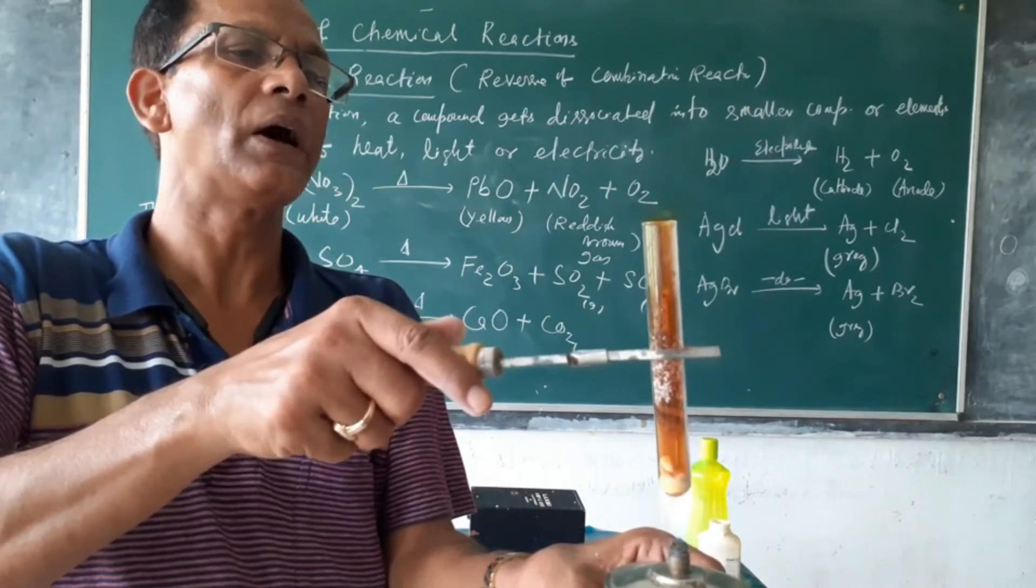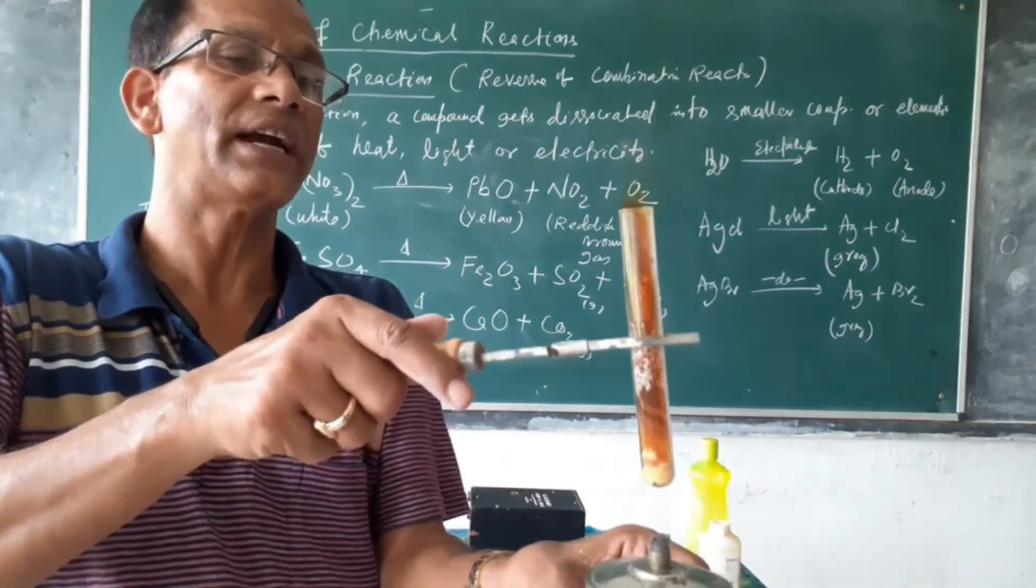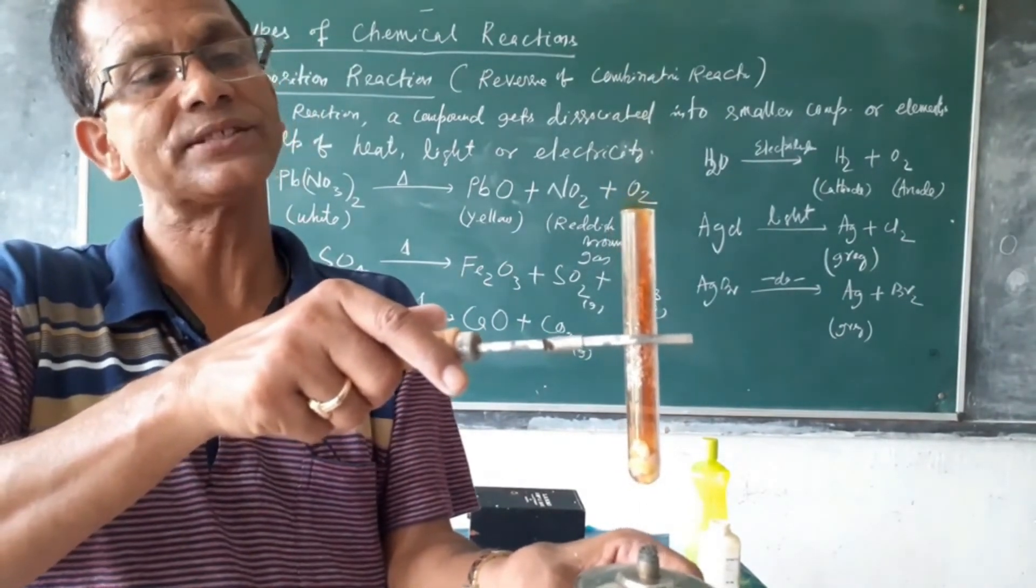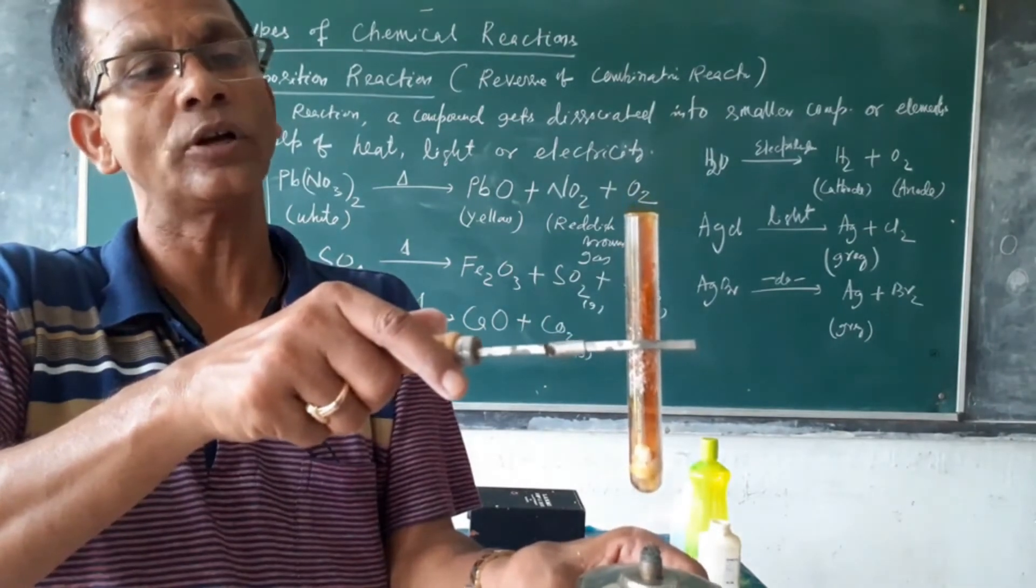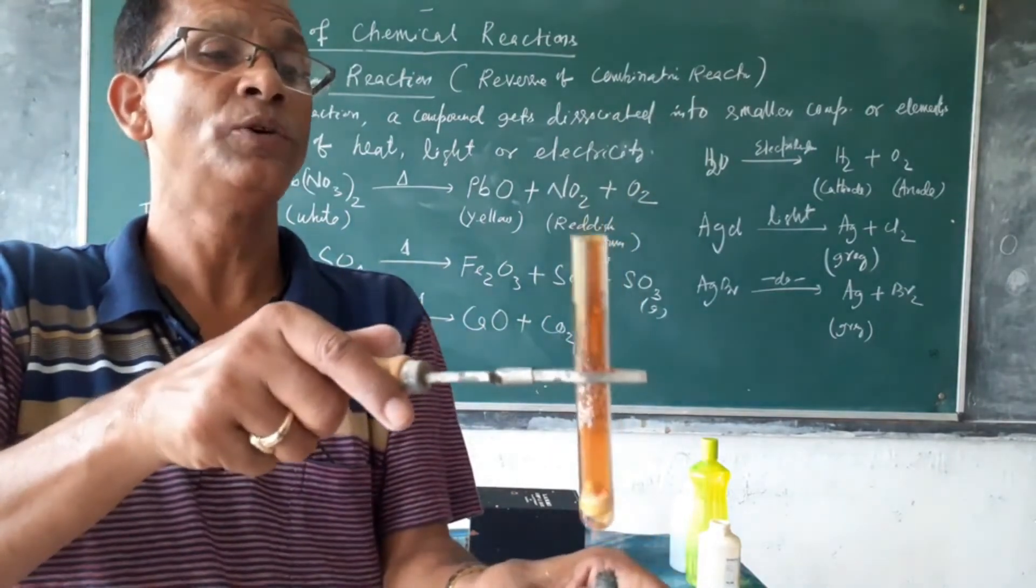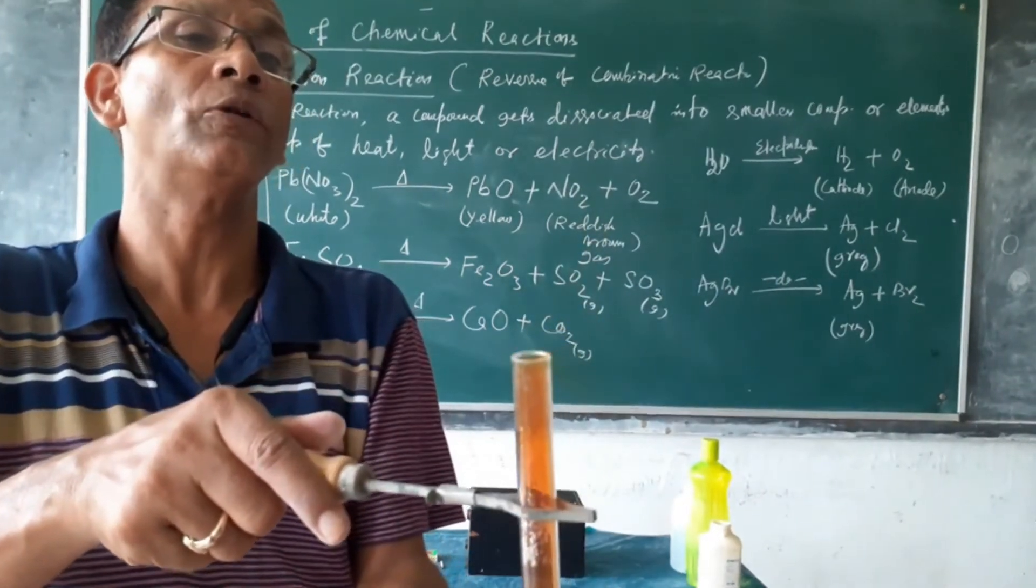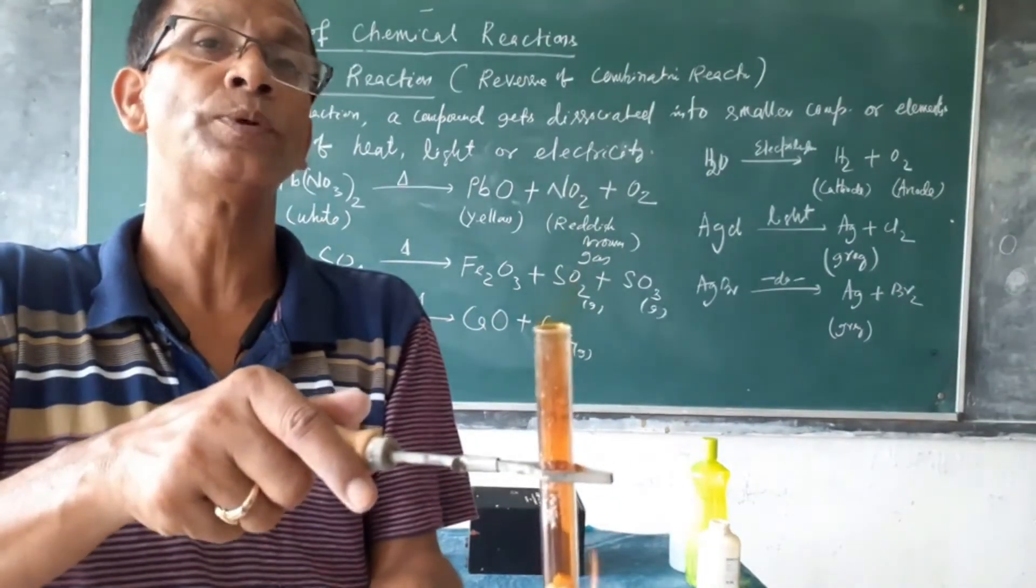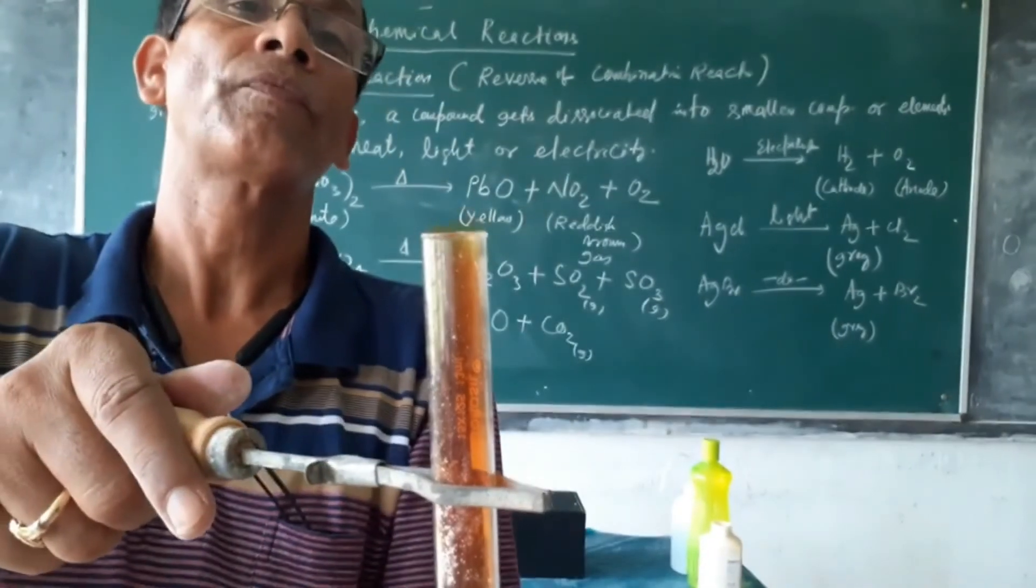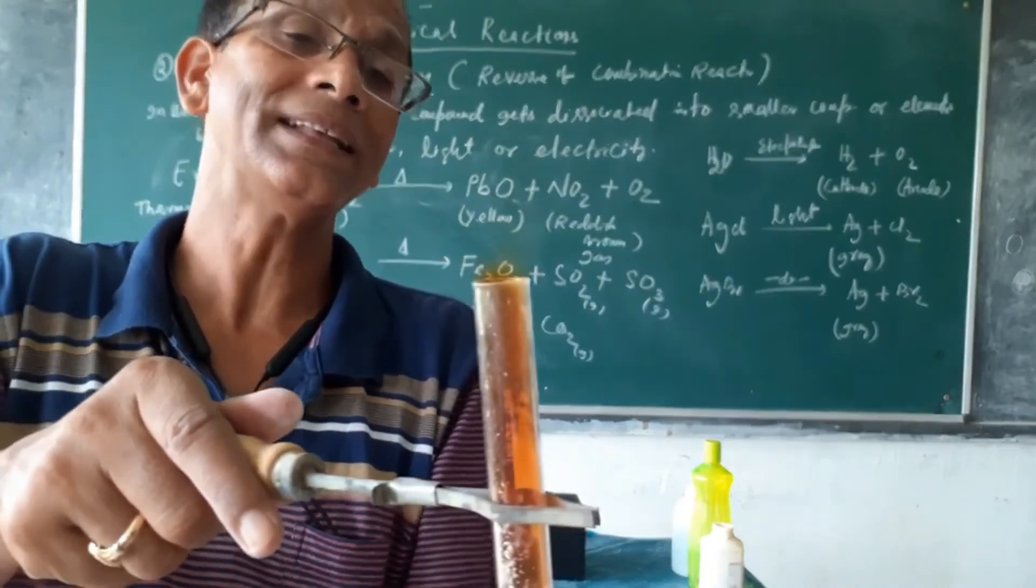You see how reddish brown gas is formed. This gas is called nitrogen dioxide. This is nitrogen dioxide and the color of this solid that remains in the test tube is yellow color. The gas produced is reddish brown. Just you see mouth of the test tube. Reddish fumes are formed. Reddish fumes are producing. This reddish fumes are formed as NO2.